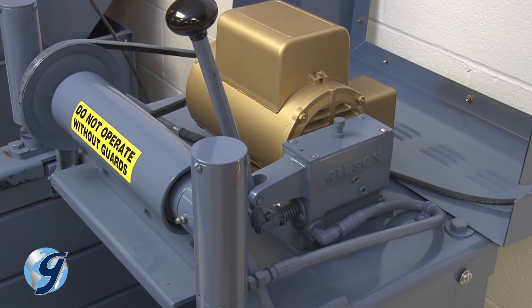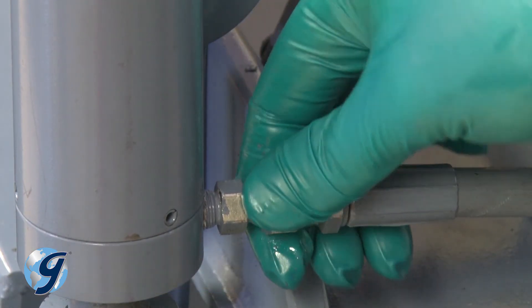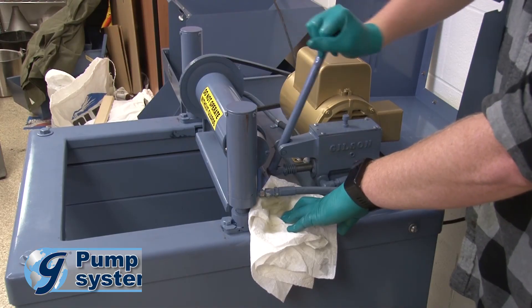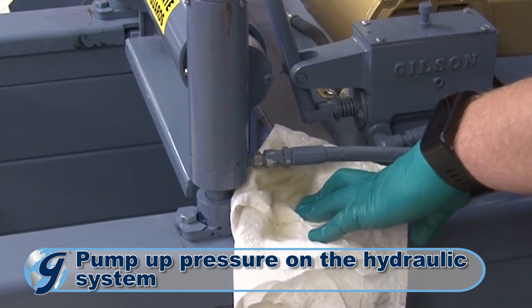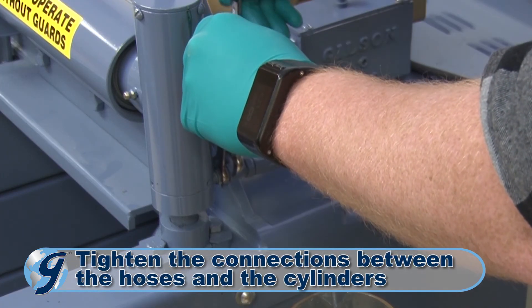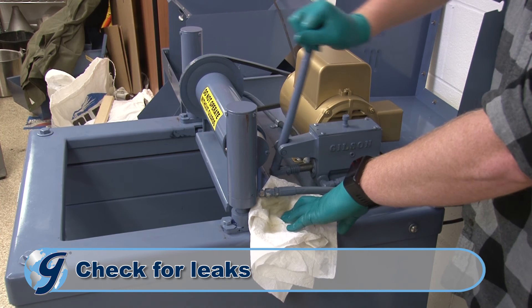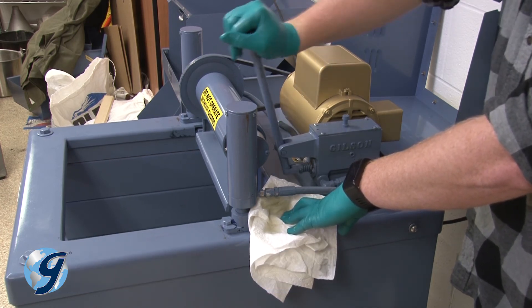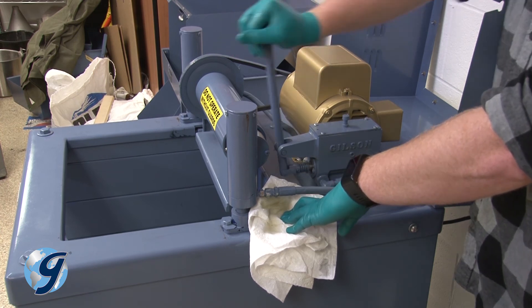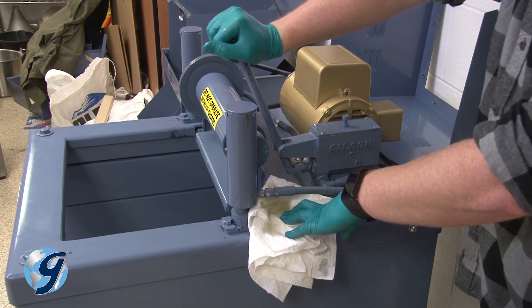Now, we are going to bleed the air out of the hydraulic system. Loosen the connections between the hoses and the cylinders by unscrewing the swivel connections slightly. Pump up the hydraulic system just until oil appears at the loosened connections. Now, re-tighten the swivel connections. Once tightened, pump the hydraulic system to confirm that all fittings are free of leaks. If the fittings leak, use hydraulic joint compound to create a seal between each leaky fitting and the pump or cylinder to which it is attached.